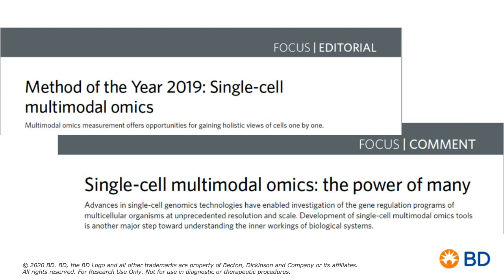Yes, thank you, Joe. Another question that we've been seeing quite a bit had to do with targeted mRNA, which is what I talked about today, as well as cataloged available AbSeq, which is oligoconjugated antibodies that fit into this workflow. Can you speak a little bit about some of the alternatives? Because there were some questions about custom RNA or custom AbSeq or providing purified antibodies. So please share some of your thoughts on some of those offerings that are available.